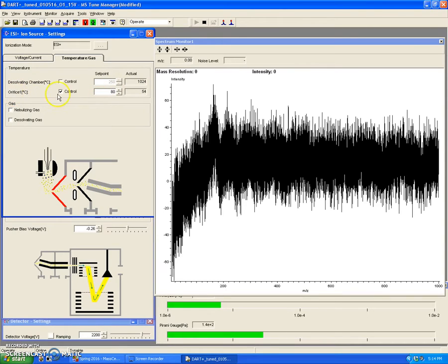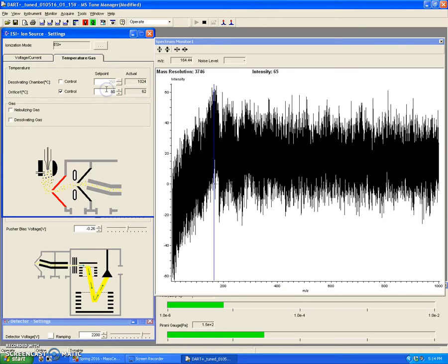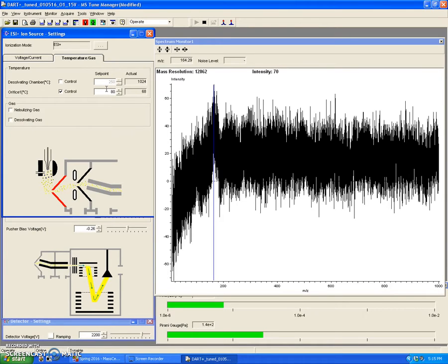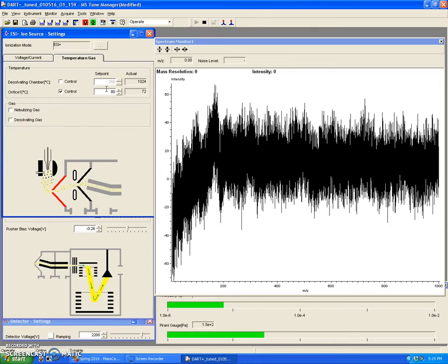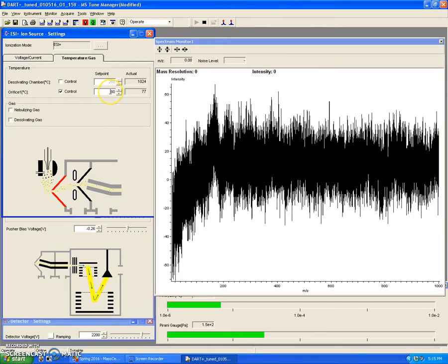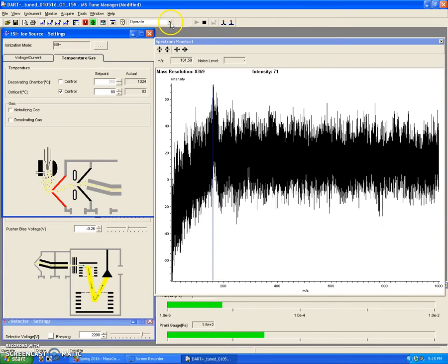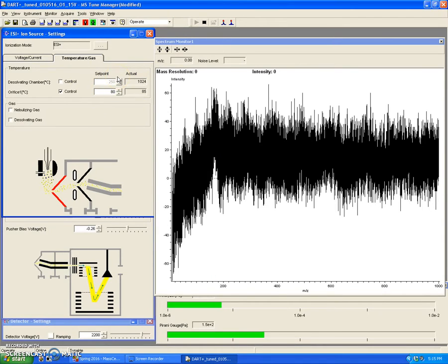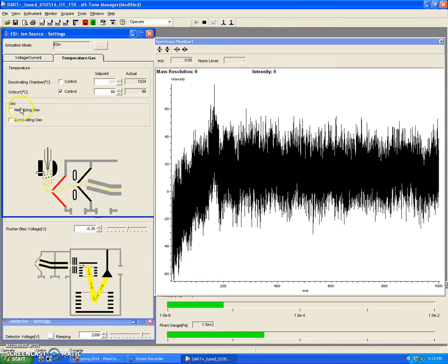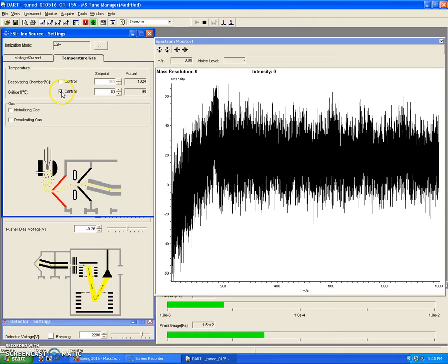So what this will do is that this turns orifice 1 on, and this will heat up to this 80-degree set point set here. What's going to happen is that orifice 1 will go up to 120 degrees about, and then slowly come down. So what you're waiting for is to be 80 plus or minus 15, but if you just turn this on to operate, don't start your analysis right away. At least give it a couple minutes to let it equilibrate. You won't need the nebulizing or desolvation gas because that's for electrospray, so you can ignore these. Just make sure that orifice 1 has been clicked.